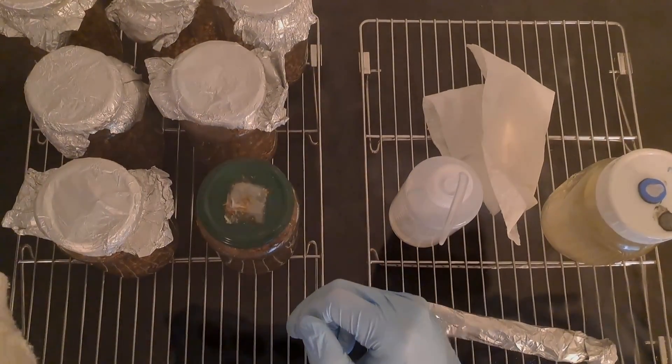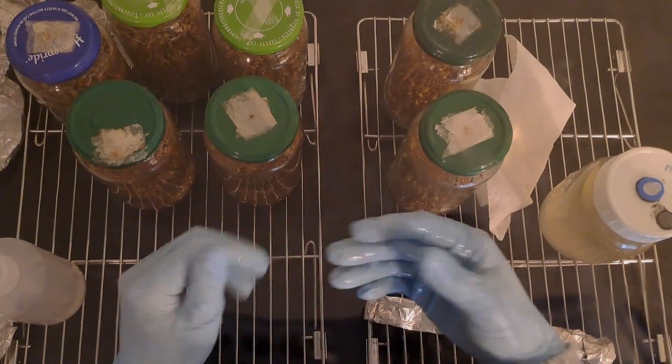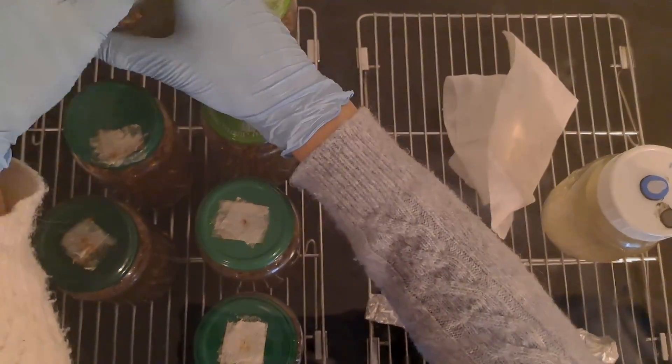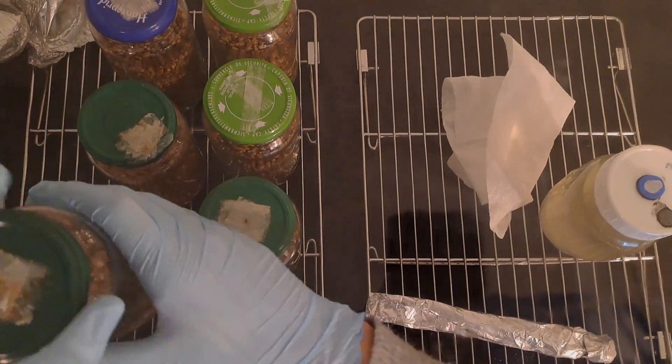First thing you're going to want to do is create some grain spawn. I'm not going to go into too much detail about how to do that here because I've got other videos which cover this in full, but this is just me inside the still air box making some grain spawn with liquid culture.